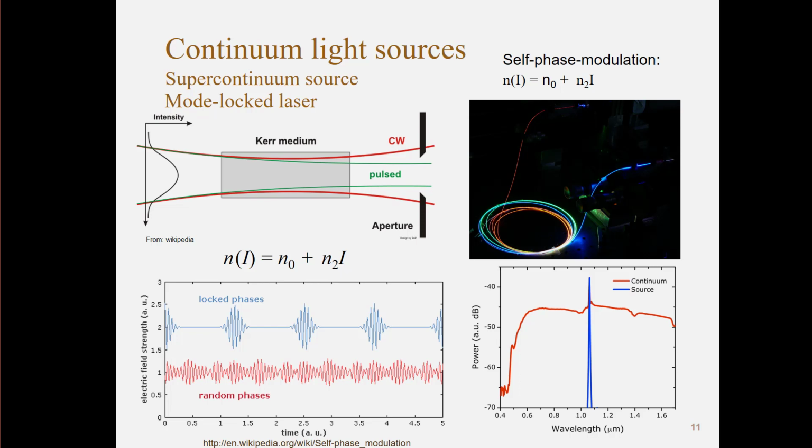However, if you compare to some of the light sources we looked at so far and some of the light sources we look at later, it's not a very cheap light source. It's slightly expensive.